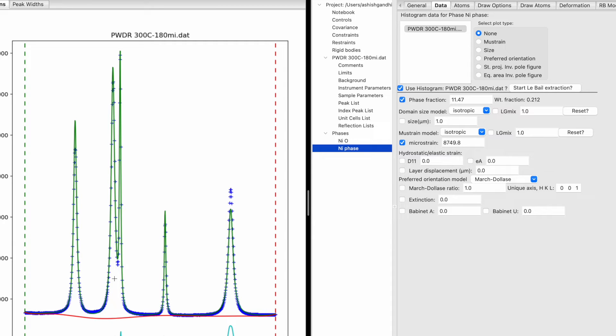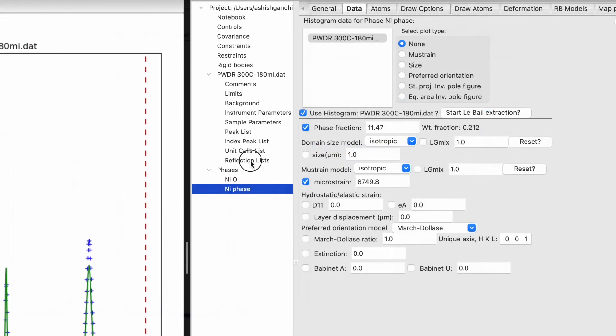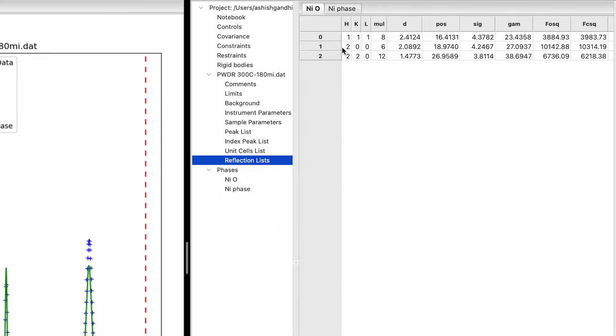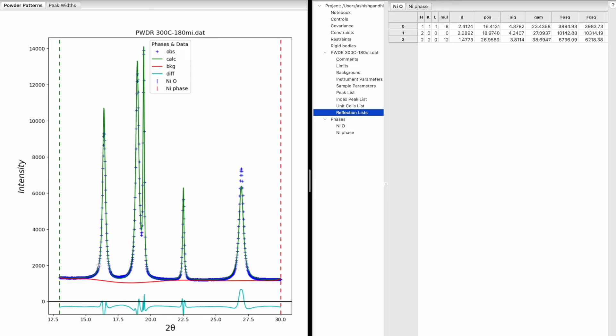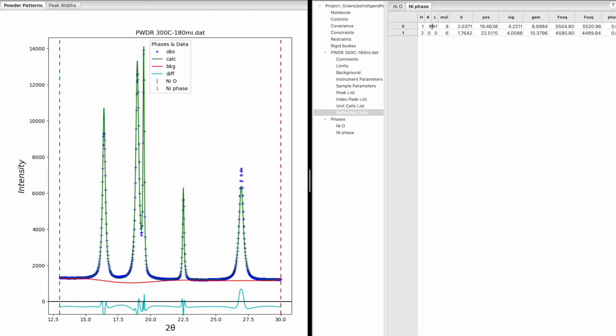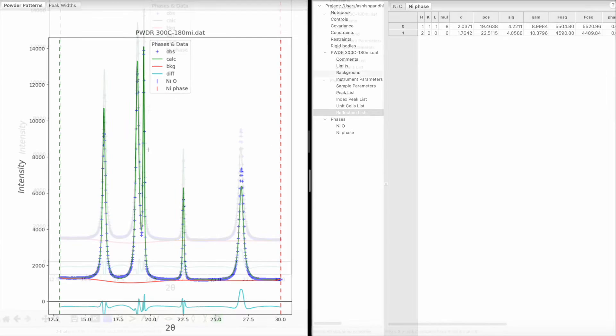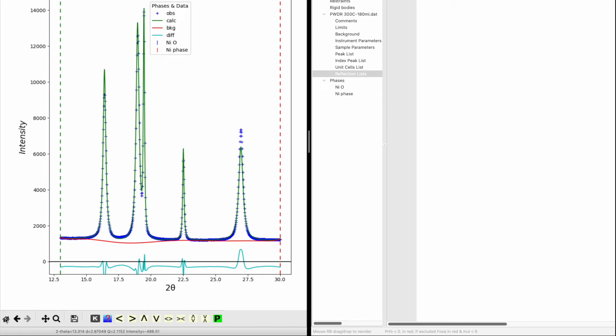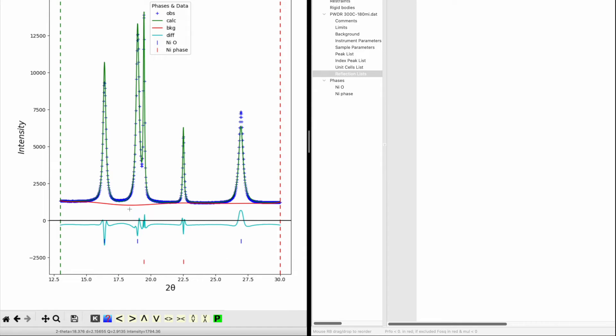To identify which phase is which, click on Reflection List. The nickel oxide reflections show planes 111, 200, and 220 at 2-theta positions 16, 18, and 26 degrees. For the nickel phase, planes 111 and 200 are at 19.4 and 22.5 degrees respectively. The blue vertical markers correspond to nickel oxide and the red markers to nickel.